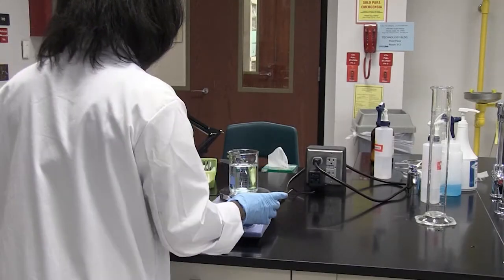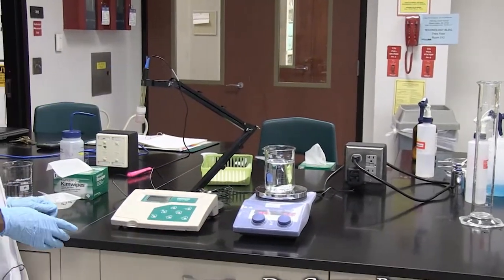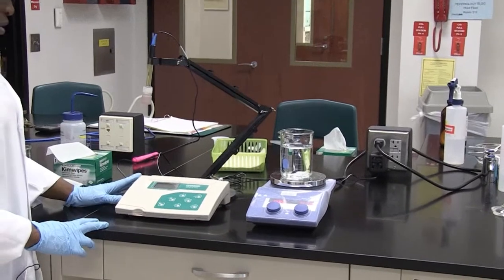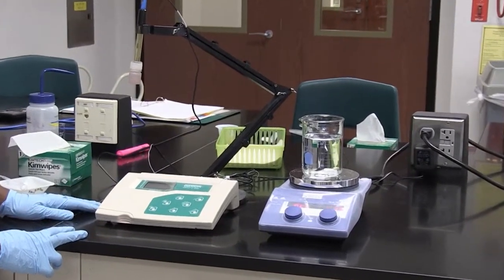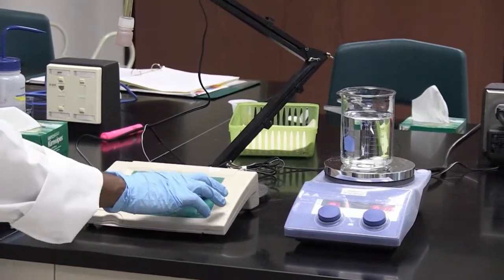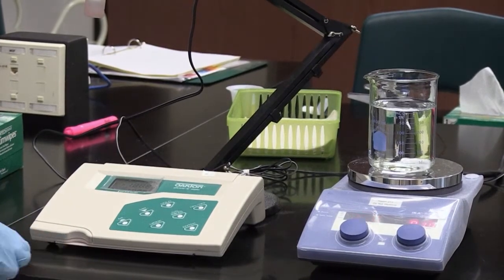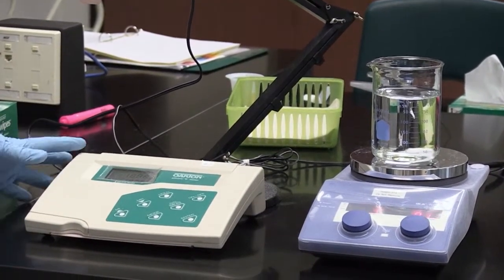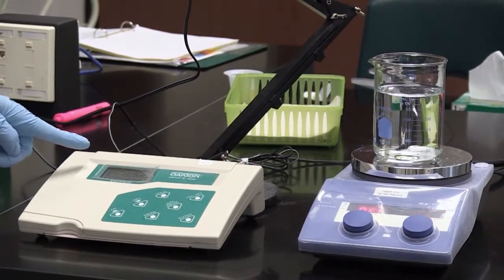Now I'm going to prepare to pH my solution. This is my pH meter. The important thing to look at is the on and off button. When I press the on and off button, it brings up whatever you were doing the last time before your pH meter was turned off. And I'm in the measuring mode.